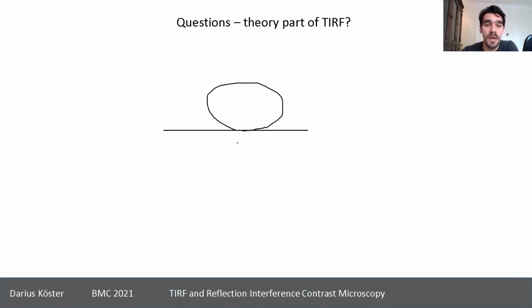Supposedly this is a circle. So either you use a bead, or if you get hands on giant vesicles, that's even better. So something that's fluorescent and round, for example. Then you can compare how your epifluorescence looks, which should give you the signal of the whole structure.